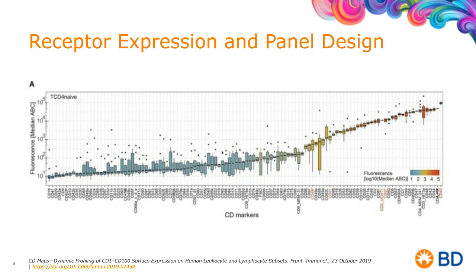And it is always good to have a good titer for that activation model system. Many times we get the question, what is the appropriate amount of expression for that model system, and it depends on what the activation system is. So be aware that the markers may change depending on the time point when you're doing the activation, and you need to make the appropriate choices for that system.